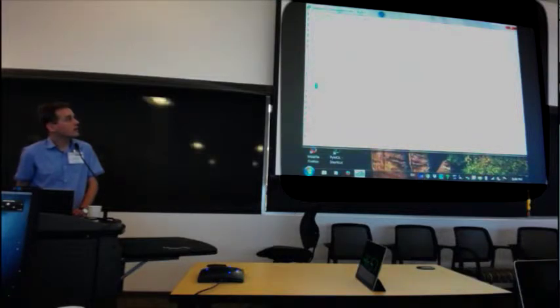Then the run numbers that contain data look like that, and this is the dark file to use with this run, the ini file for CASS to use for this run, and the CrystFEL ini file to use for that run. You should only have uncommented those two lines so that we don't submit all of the jobs to the queue, but just those two for everybody.